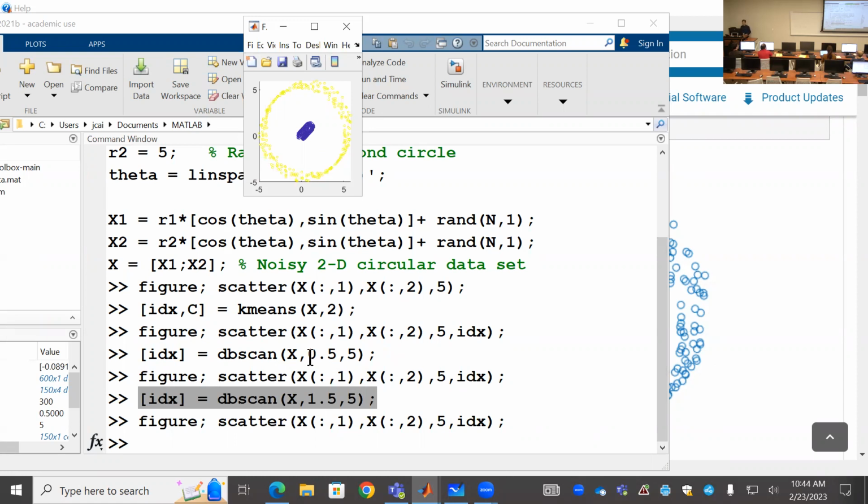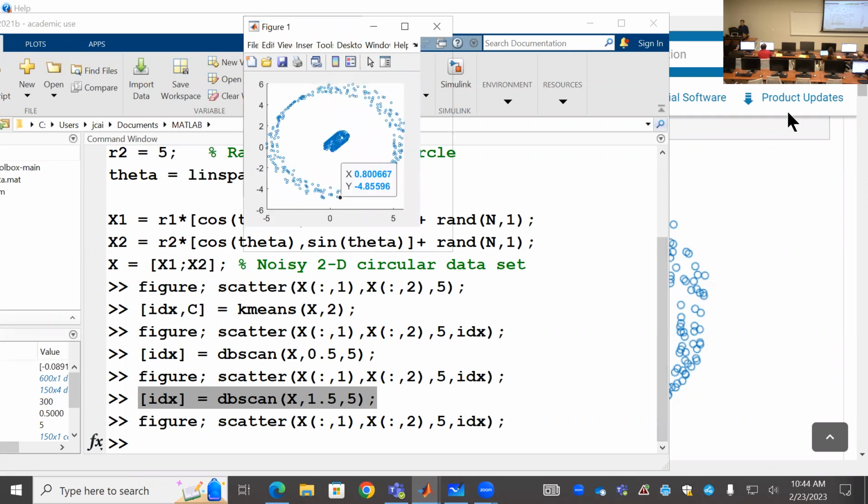This is a problem for dbScan. So in this package, I just cannot use dbScan, although dbScan is sometimes useful as it is density based, if you have a cloud of cells which is highly dense, where another is not so much. But I have no guarantee I can set up this hyperparameter correctly to solve the problem. So I cannot use this function at all. What parameter did they use in the example?